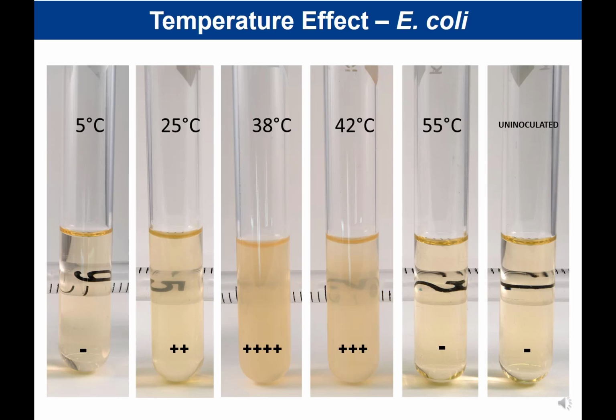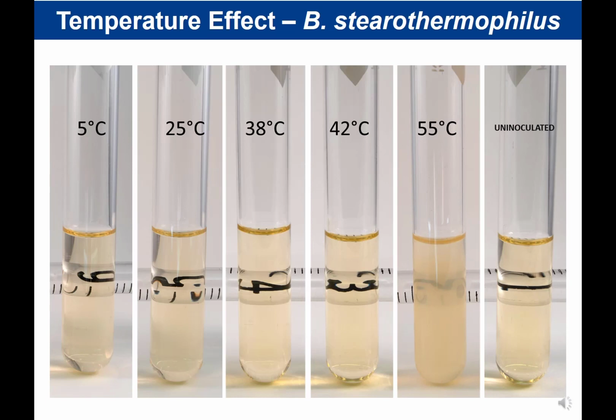And the answer should be yes, because its normal habitat, or where you normally would find E. coli, is in the gut of humans. And then the last organism that we have is Bacillus stearothermophilus.